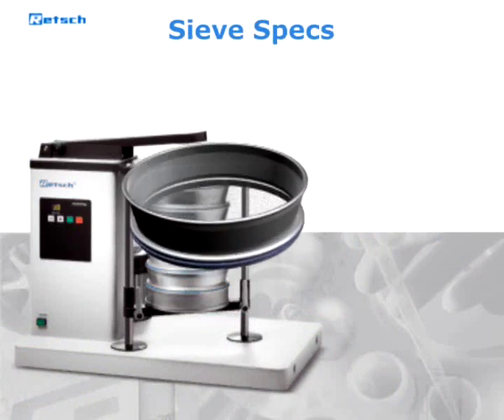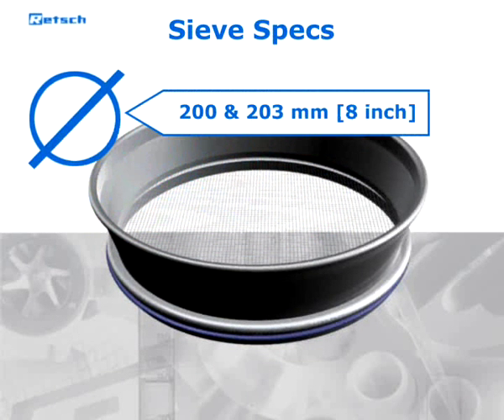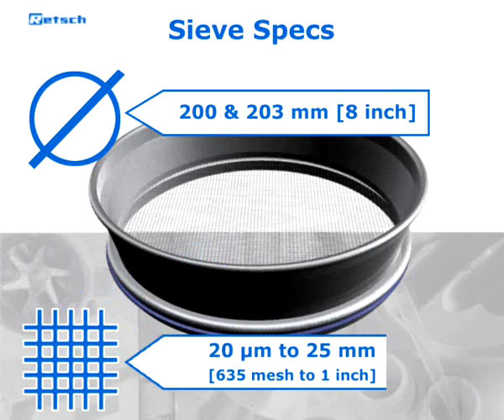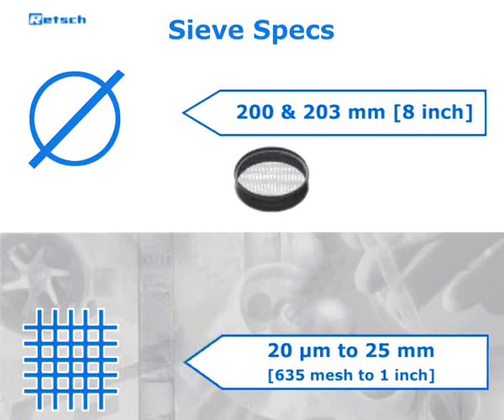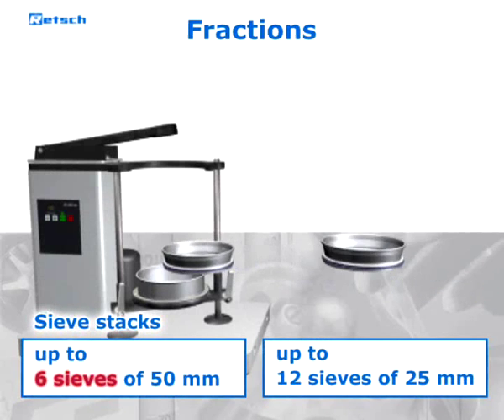The sieve shaker is suitable for sieves with a diameter of 200 and 203 millimeters (8 inch), and covers the size range of 20 micrometers to 25 millimeters. It accepts up to six full-height sieves plus a collecting pan.